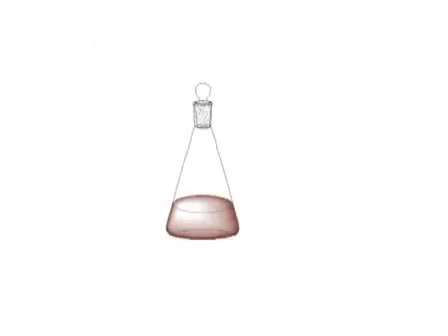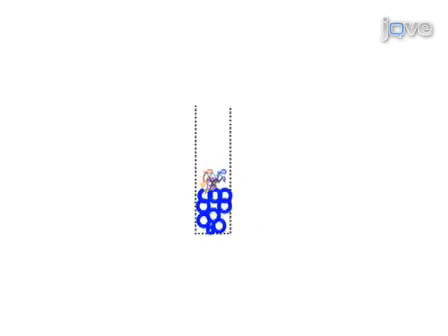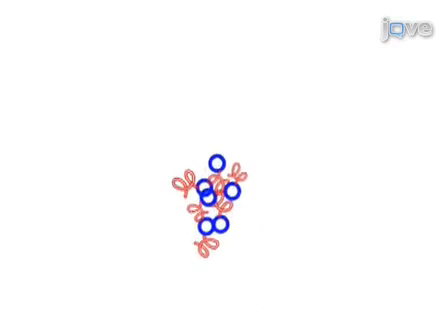This procedure begins with overexpression of the recombinant C-terminus of the purinergic P2X receptor, or P2X2, engineered as a GST fusion protein. Following bacterial lysis, purified protein is incubated with glutathione Sepharose 4B beads, and the concentration is read using the Bradford method.